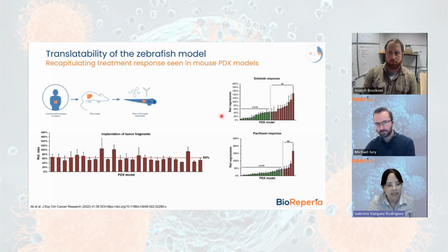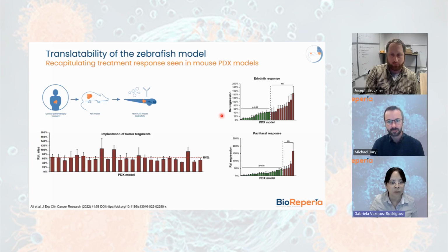So it's possible to use zebrafish embryos to evaluate different PDX models and to evaluate the correlation with the mouse PDX models. This study was performed in collaboration with Charles River. At Charles River, they receive clinical samples, implant them in mice, and expand them, creating a vast library of PDX models. We received approximately 30 different lung cancer PDX models from Charles River, as cryopreserved chunks.